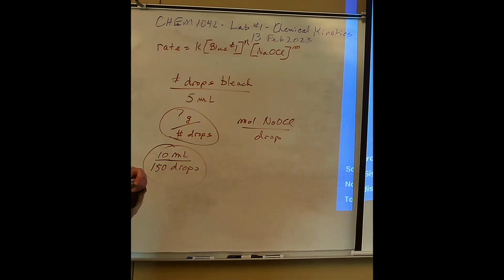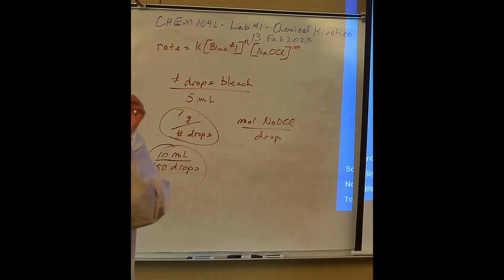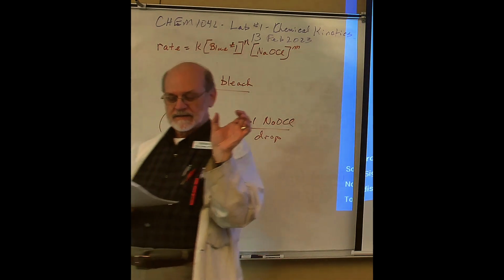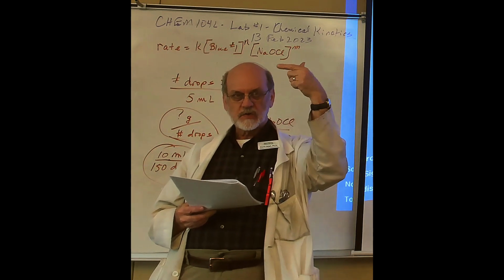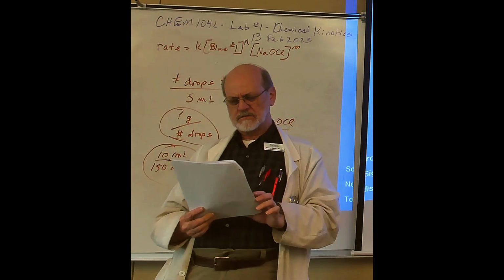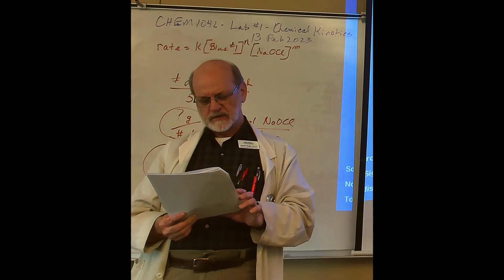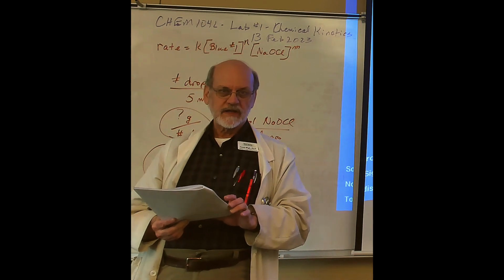And then the second sheet, where we talk about actually finding the K, I go through that step by step, and the K prime is that pseudo rate constant. And the K prime is equal to the true K times the concentration of the bleach to the order, the power. So that's why you have two of them toward the bottom of the first page. You see the ratio of the K prime full and the K prime half. That's what we're getting at.